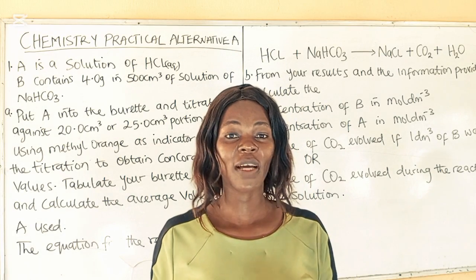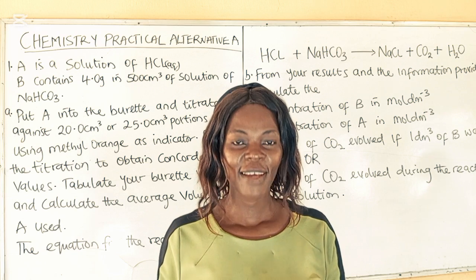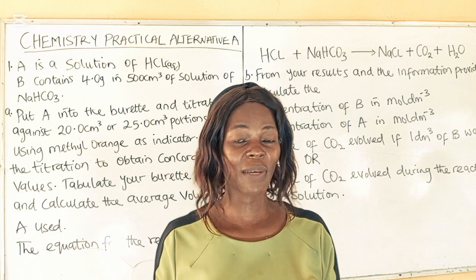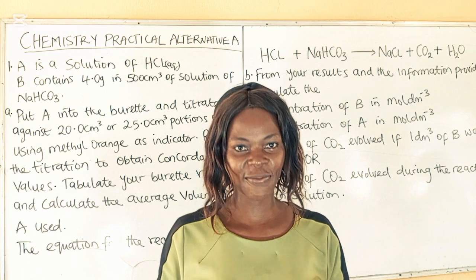In today's video, we're going to have an analysis of the chemistry practical alternative A. So I want you to watch this video to the end as I guide you through most likely questions you might actually see in this forthcoming exam. With no further ado, let's get right into the video.